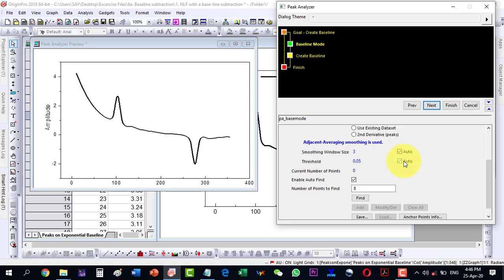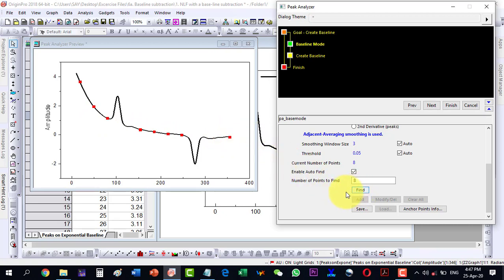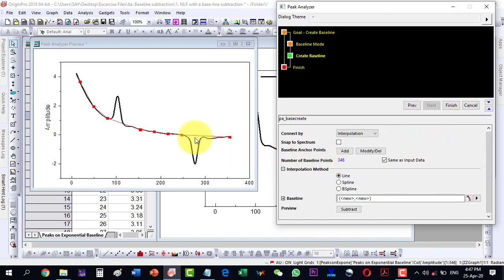We keep the smoothing size at default. The threshold is 0.05 and is also set to auto. The current number of points is 0, and the Auto Find option is enabled. The number of points to find is 8 by default, so we click Find and it locates 8 points automatically.